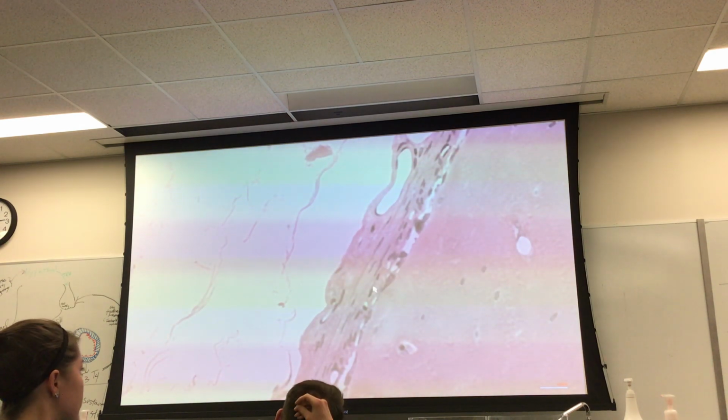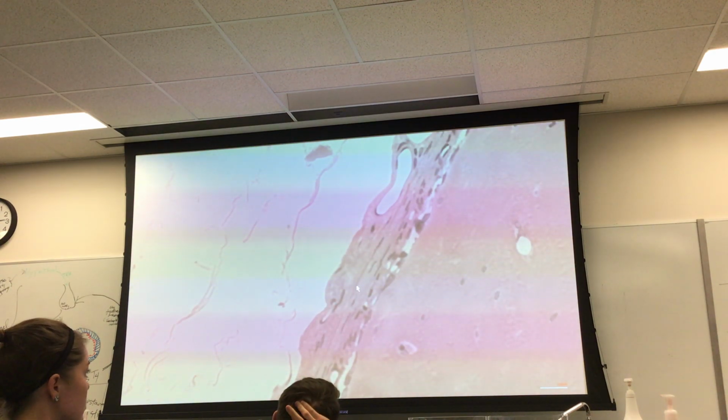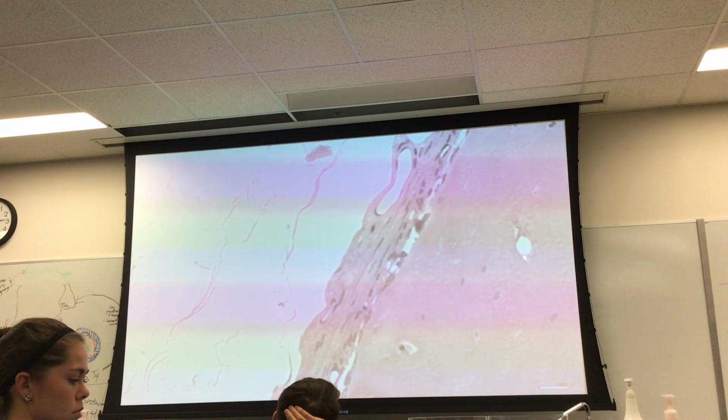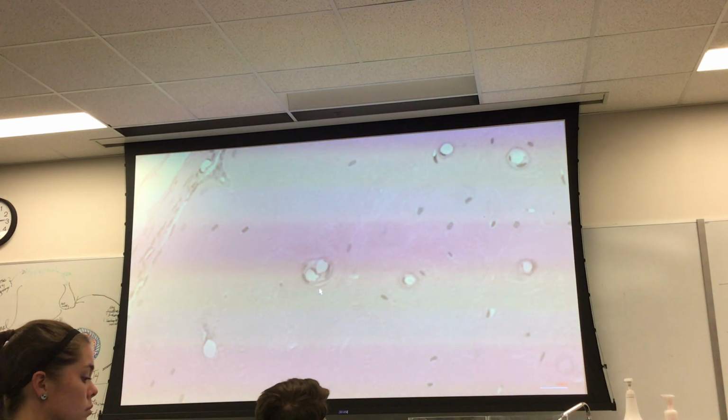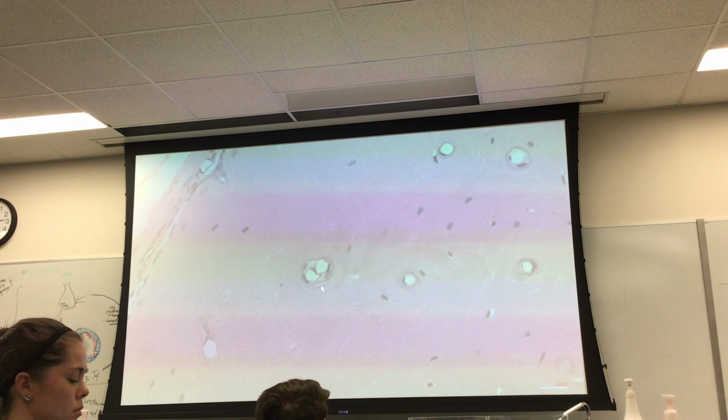But when now you come to the edges of bone, for example, on the outside edge, this is the periosteum. And when you have a space like this, you have to look around. Is there any cement line around this? And the answer for this one is no. And similarly, as you look at this over here, the answer for this one is no as well. No cement line. When you see that, you call that a primary canal, different from a haversian canal. So cement line really becomes a pretty important observation.